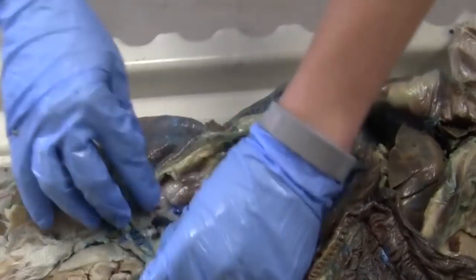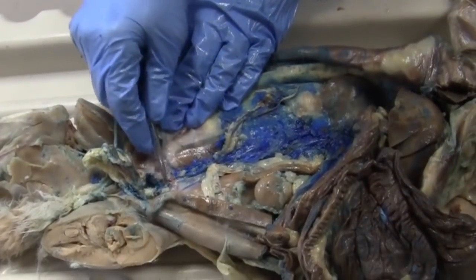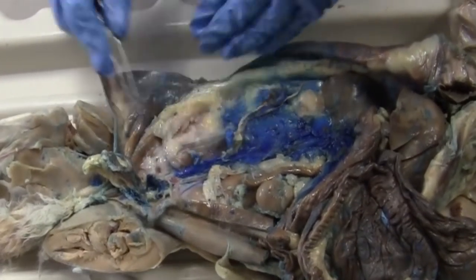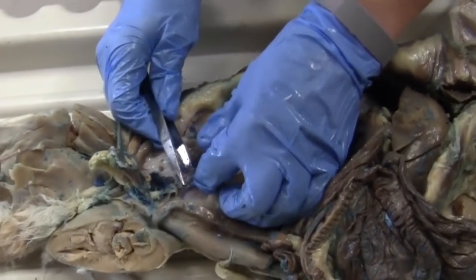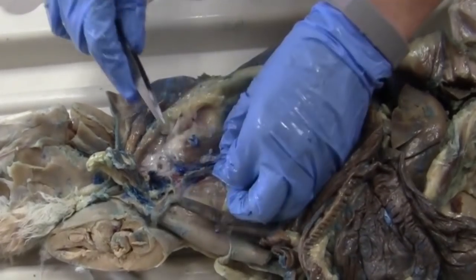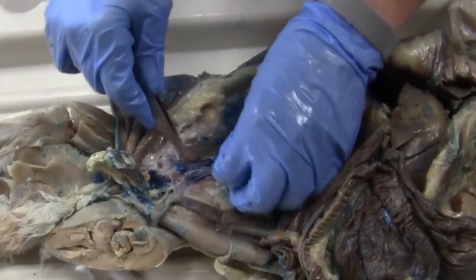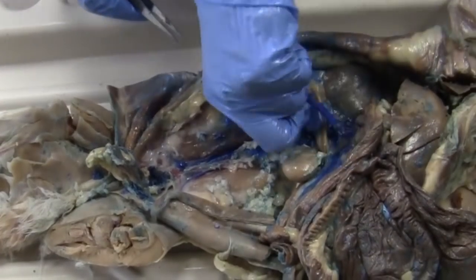Okay, back down here. So I'm going to find, you can see my aorta really well right here at the bottom of the animal. Also my caudal vena cava, which once again exploded, but that's just all plastic dye right here. I'm going to take some of this out.